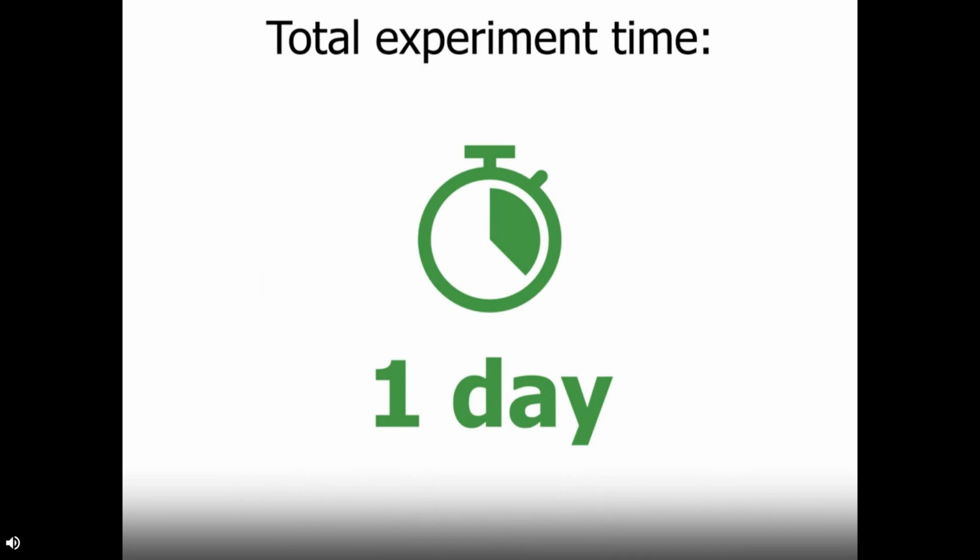And also importantly, I want to emphasize that this whole experiment took about 24 hours of experimental time. The buffer exchange on Big Tuna took just a couple of hours, and then 2 rounds on Uncle with one of them overnight, and we were done with this whole experiment and data set pretty fast.